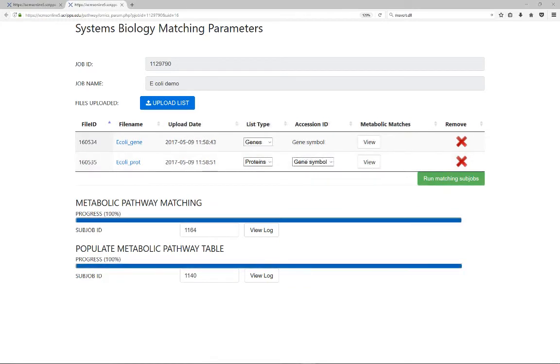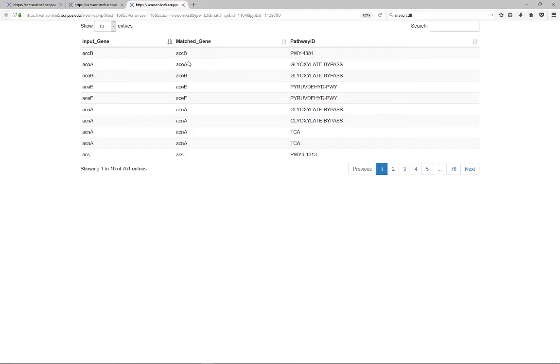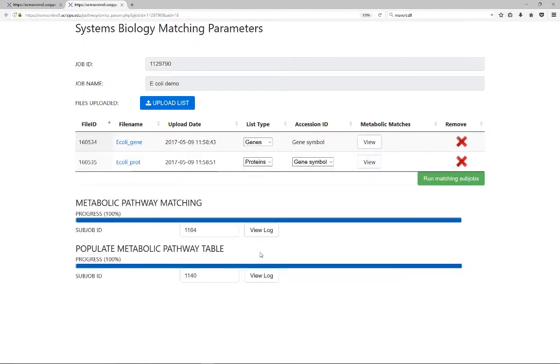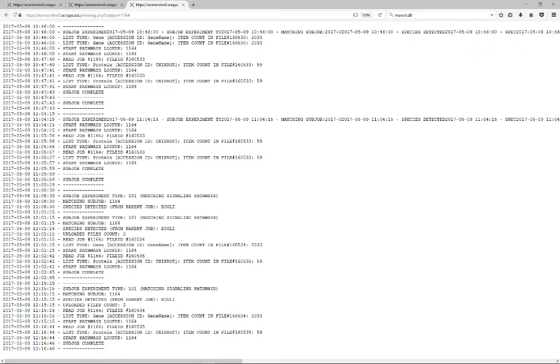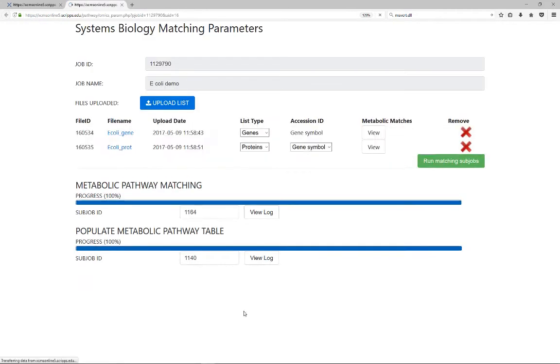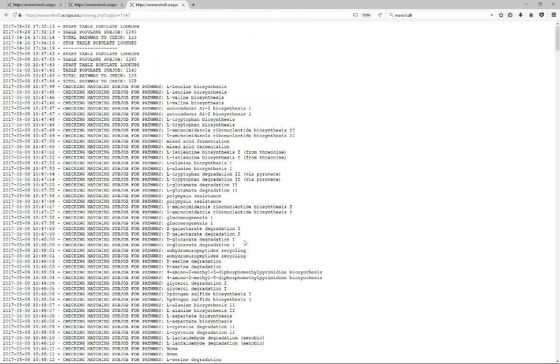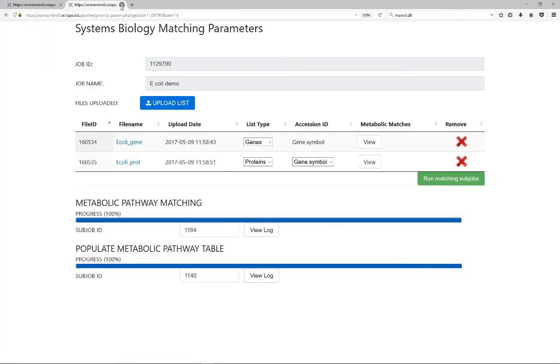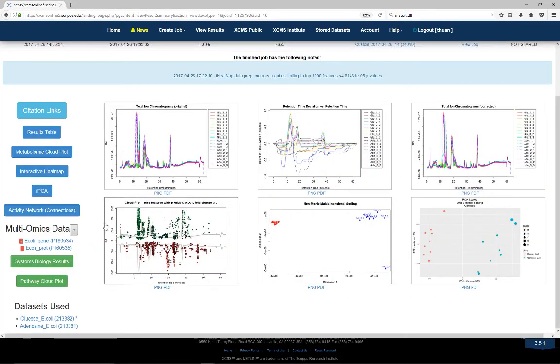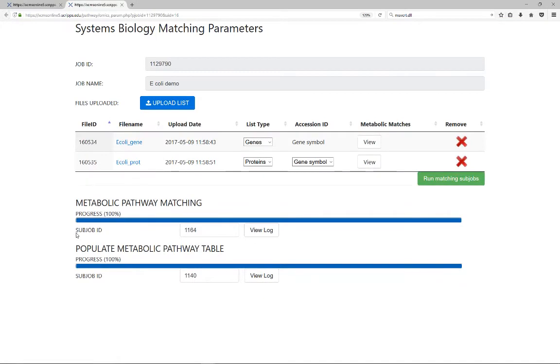The multi-omic integration results can be seen by clicking View Results to see the matching genes or proteins and their pathway involvement. A run log is also available after the job is finished to check for completion statistics or error messages. Once the job is complete, this window can be closed. This data is available for review at any time by pressing the plus button again.